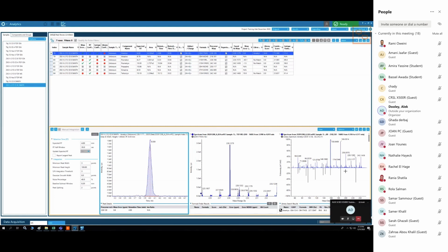So, I can leave it open to you guys. What you could do then is purge very well the A and the B now. I would suggest you do 2 rounds of purge in case some air got into the system. And then you could set exactly the same batch running tonight. And then we'll check it together tomorrow, if the retention times are stable.